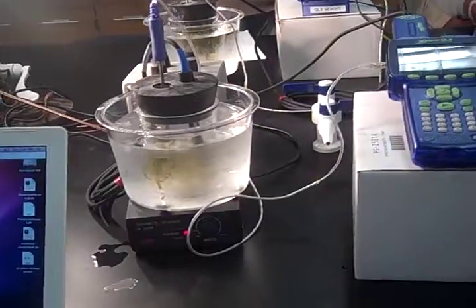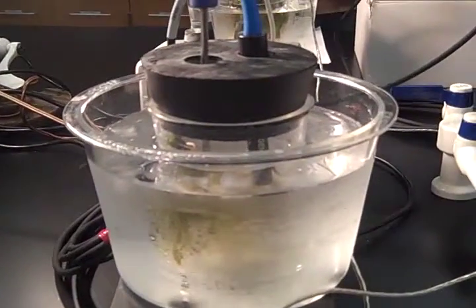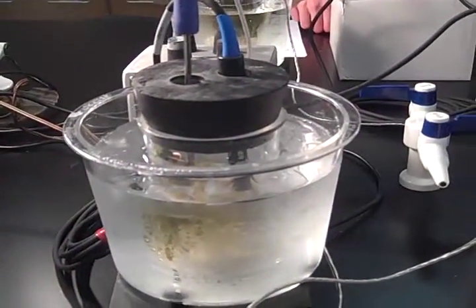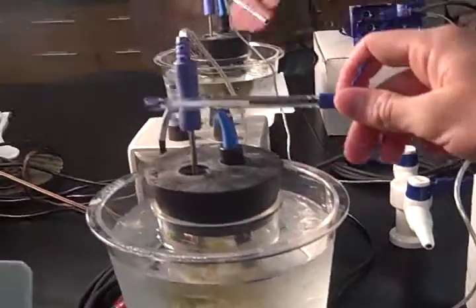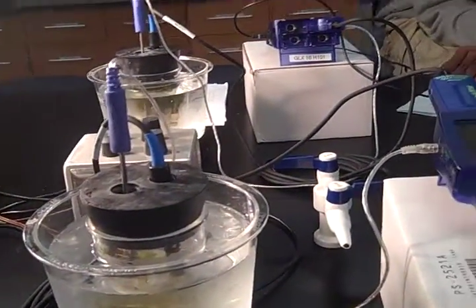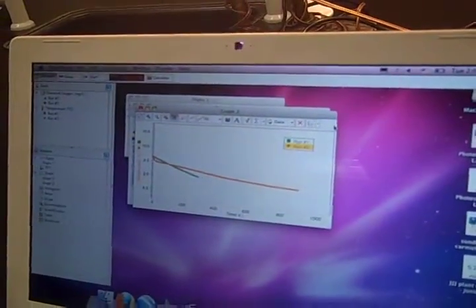The setup is the Pasco photosynthesis tank with water and ice in it, with a glass inside of it containing more water and the aquatic plants. The lamp acts as a fake sun and makes the plant give off oxygen. The temperature meter just lets us visualize the temperature on the screen, and the oxygen meter lets us see what's going on with the dissolved oxygen. And the GLX is pretty much telling us everything, and then it's all displayed on the map. Simple as that. Alright, we're done.